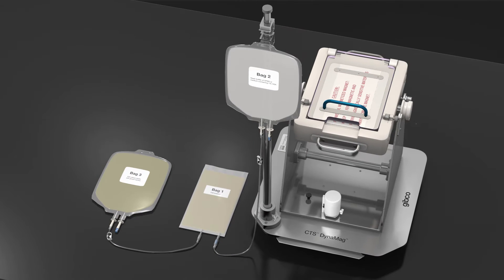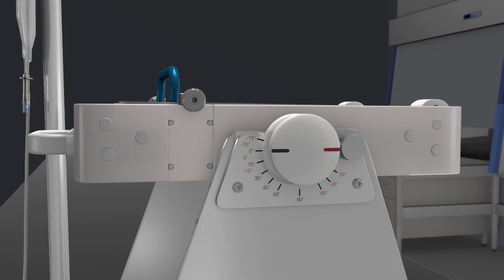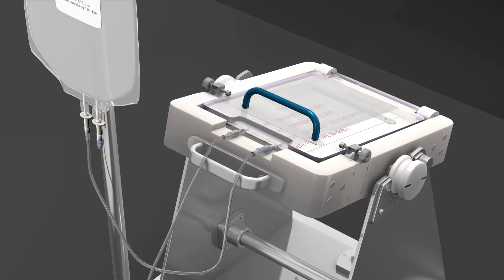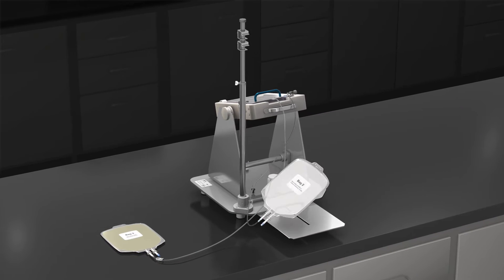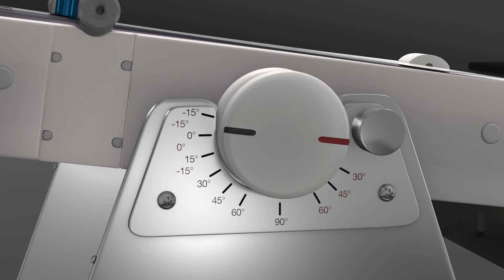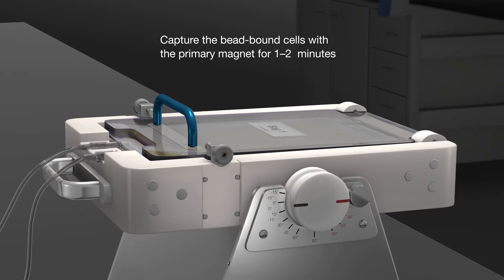Add wash buffer from bag 2 to bag 1. Set the primary magnet operating angle to minus 15 degrees and install bag 1. Extend the retractable plate and install bag 2. Install bag 3 on the solution pole with the clamp closed. Set the primary magnet operating angle to 0 degrees and capture the bead-bound cells with the primary magnet for 1 to 2 minutes.